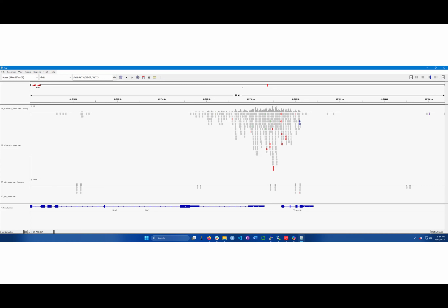Is there a metric to compare that, not just going gene by gene, but genome-wide or something? Yes. Yeah, I'll get to that in a sec. Yes, perfect.